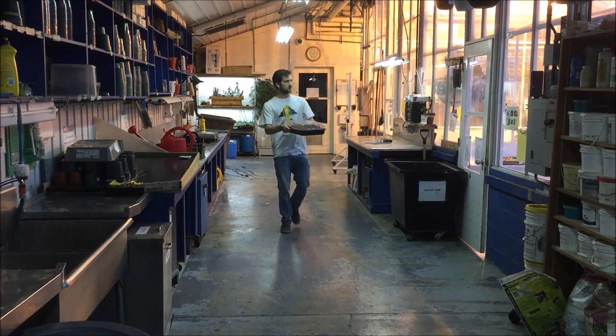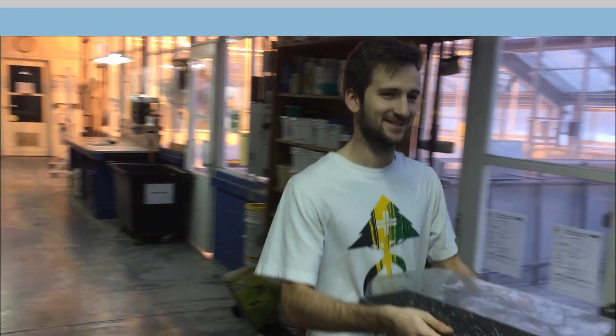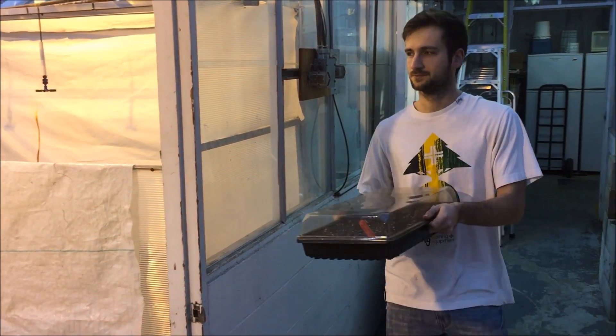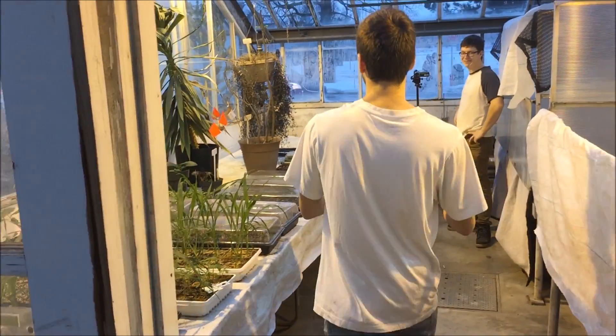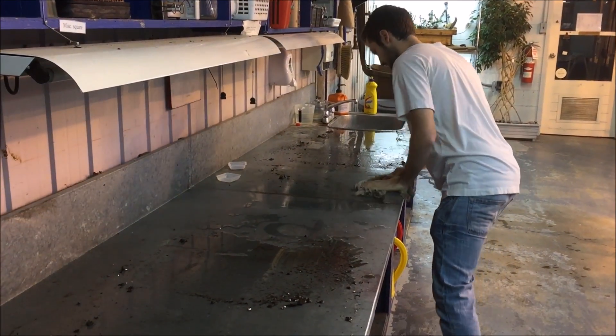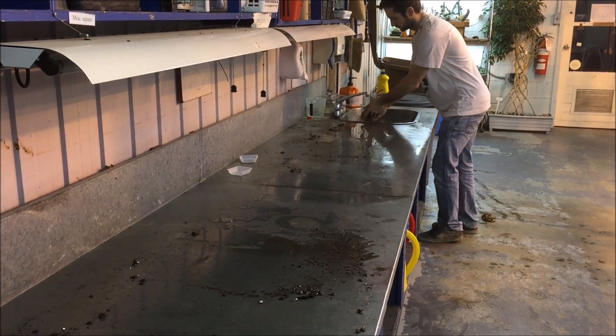Once this is done, the trays containing seeds are brought to their growing environment in a greenhouse where the conditions are controlled to favor optimal growth. After using the greenhouse facilities, don't forget to clean your working station to be as clean or even cleaner than when you started.